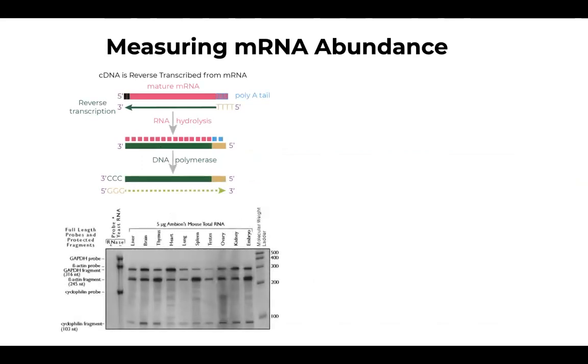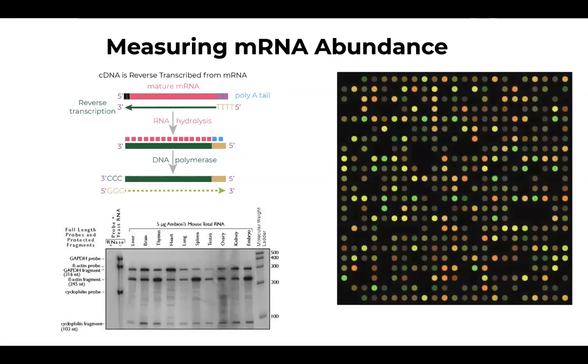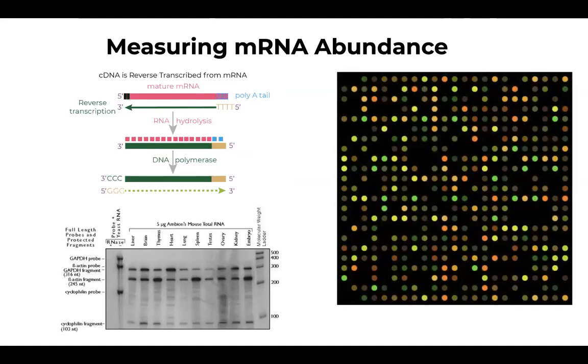So let's review what we talked about in our last session. We discussed how the abundance of mRNA in a bulk RNA-seq sample is the objective of this analysis at the first step. When we want to prepare a table of expression, we want to compare the abundance of mRNA per sample, and there are many different techniques of doing this.